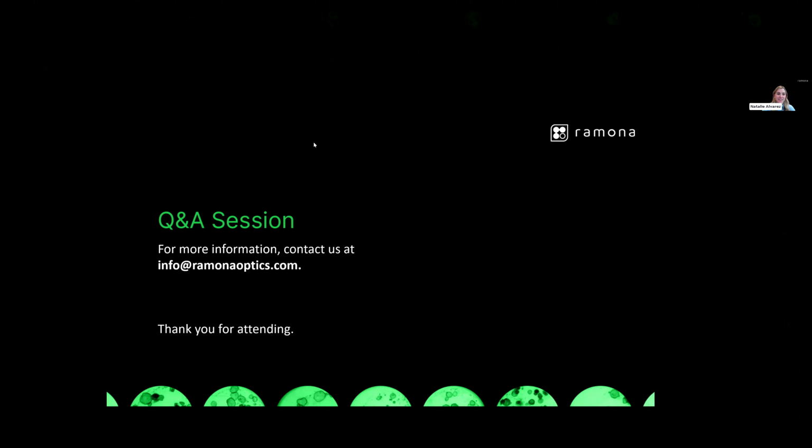Right, exactly. We have a couple other questions from Ian as well. So he specifically was asking in response to Franz's talk, have you considered writing to Zarr with OME-Zarr? I think there would be favorable write-up speed and cloud access benefits.